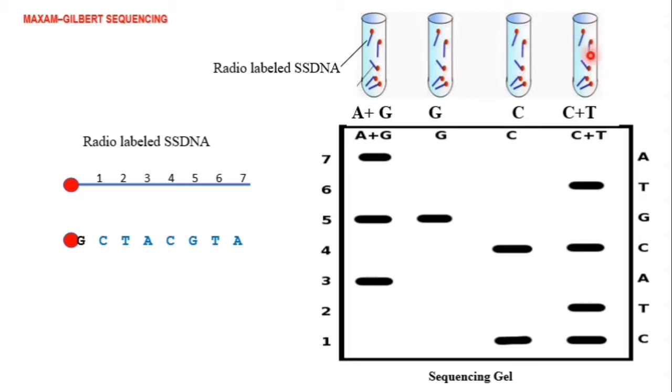Now we can see this. If you come here, this is the downstream part, the lowest part of the gel. The fragments here will be very small.